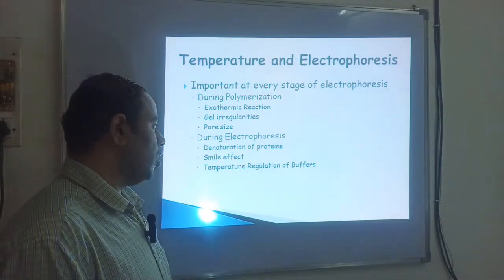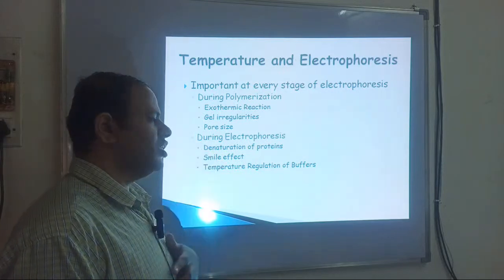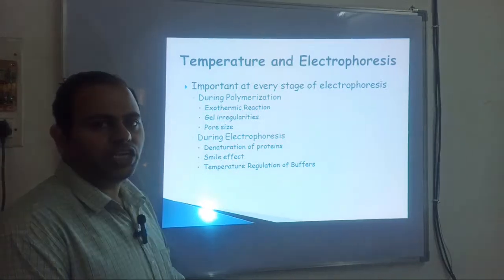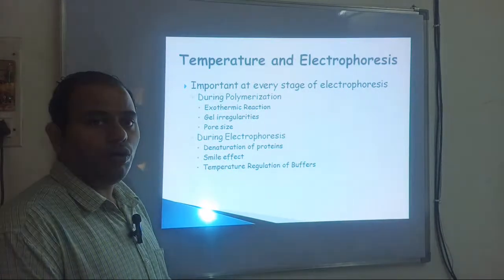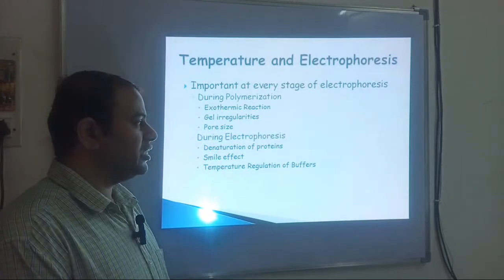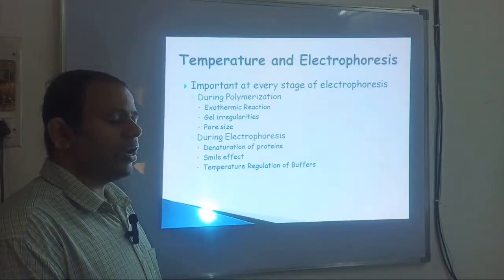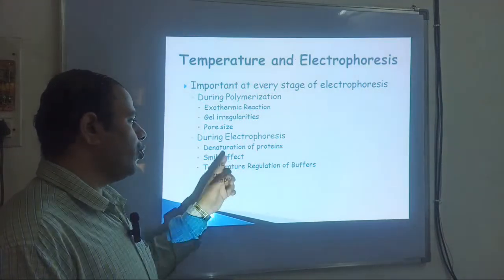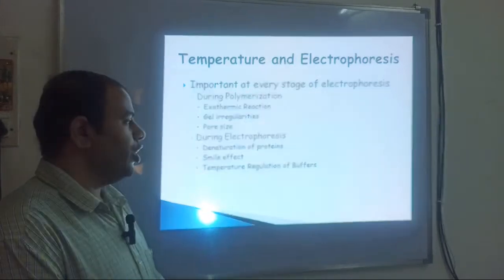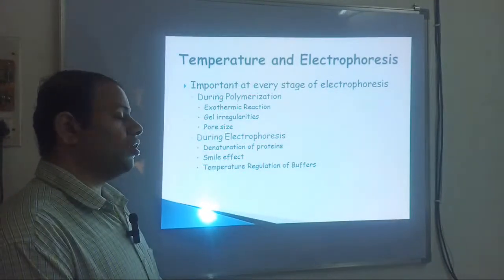Now, in electrophoresis, you have to take care that your protein does not denature. If heating is excessive, as more voltage or current is supplied, then your protein gets denatured and is not going to separate properly. So therefore you have to maintain a constant voltage.